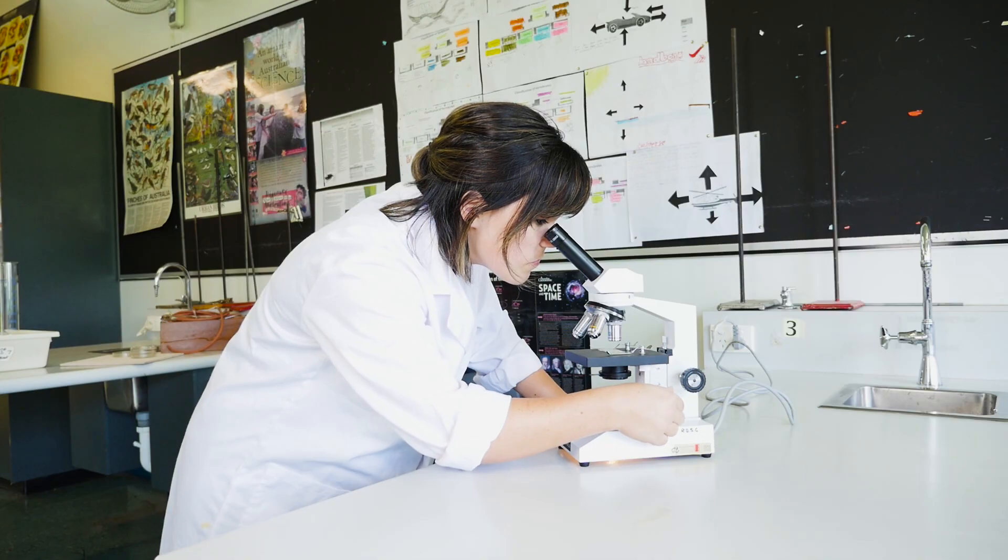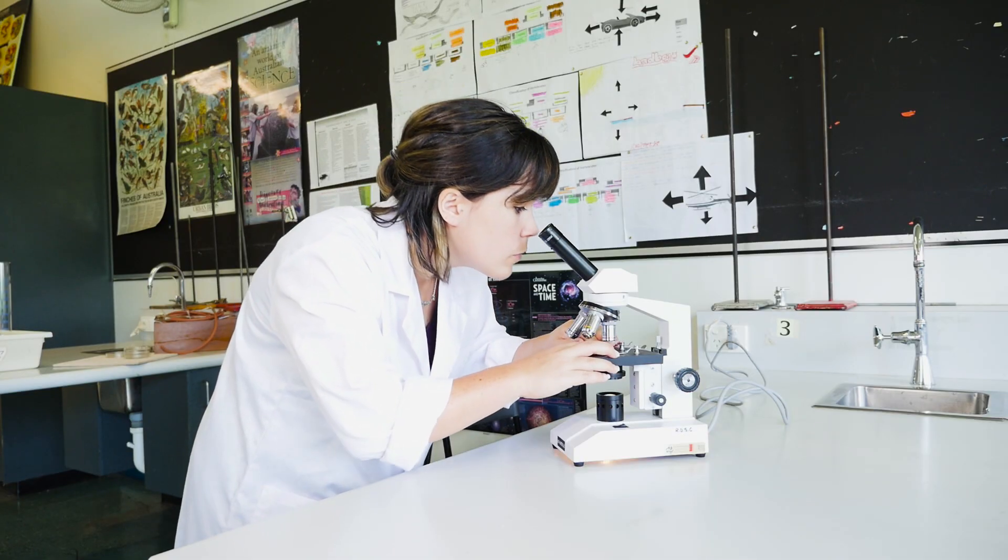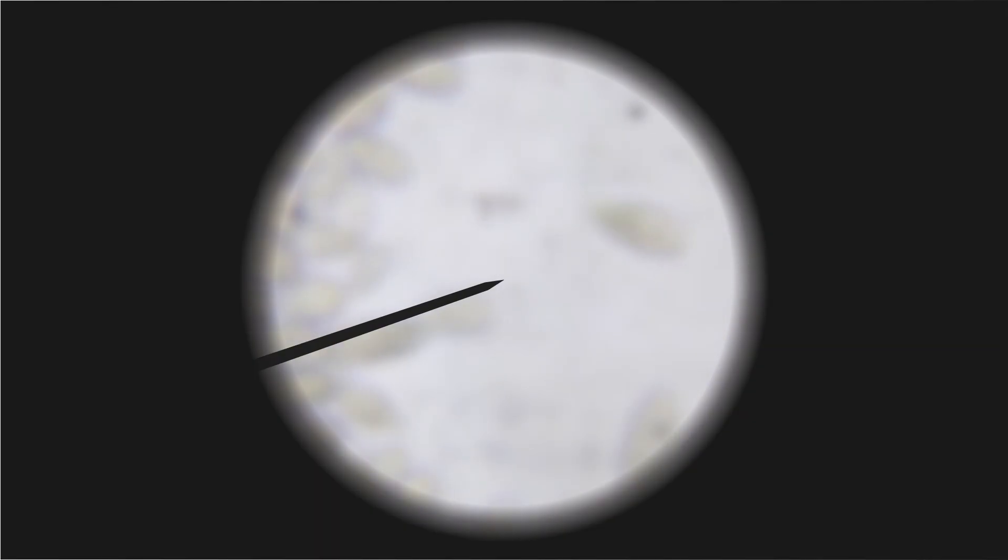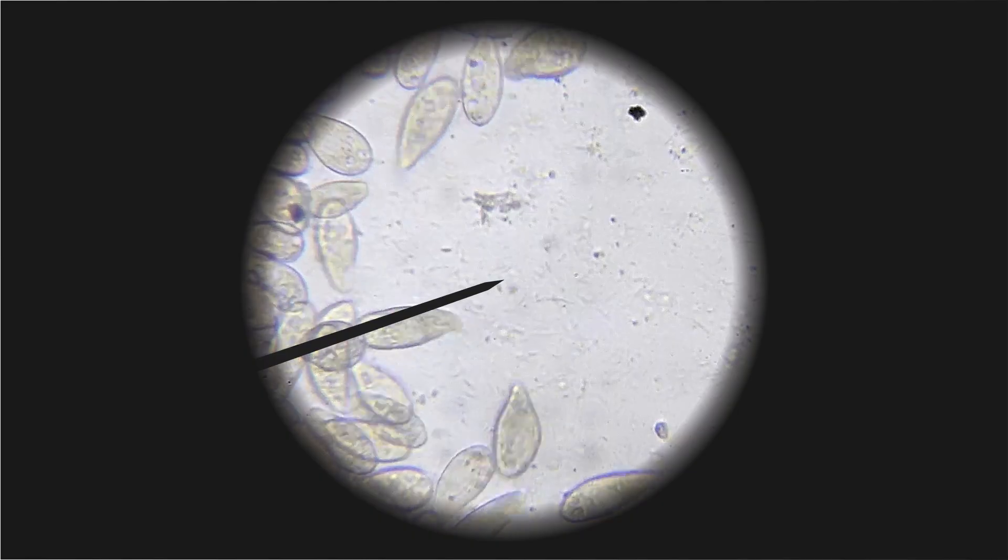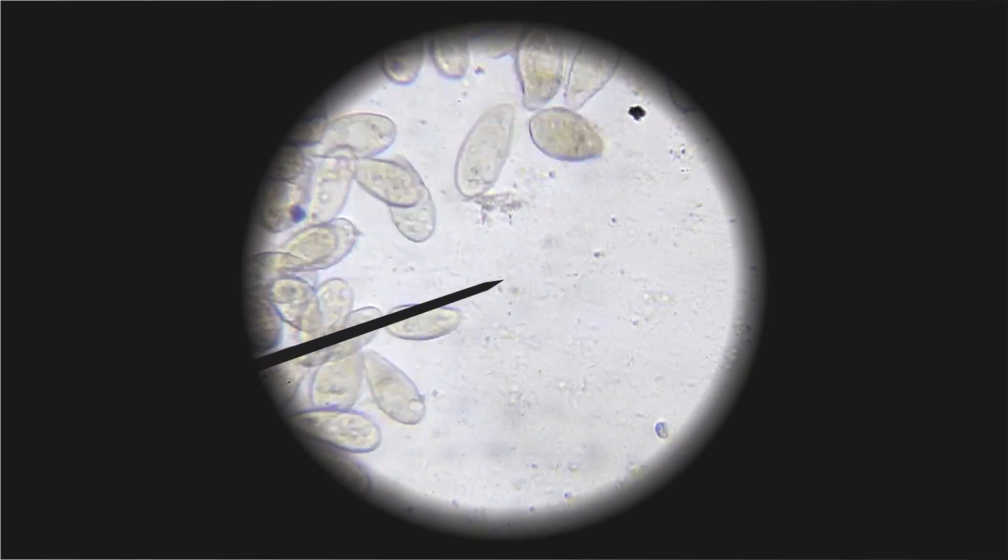Before zooming into the next objective lens, make sure that the specimen is exactly in the center of the field of view. Many microscopes have a small needle you can see which shows you exactly where to move a specimen so it's in the center. This will help you to zoom in on the part you want to see.